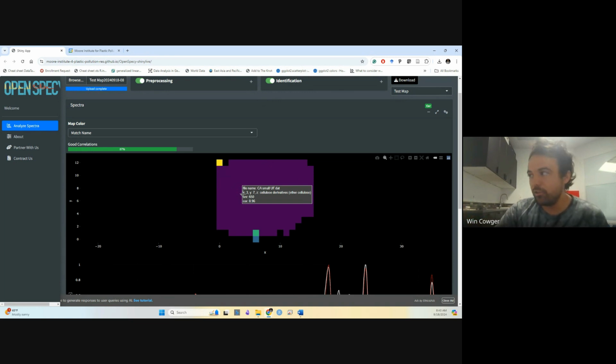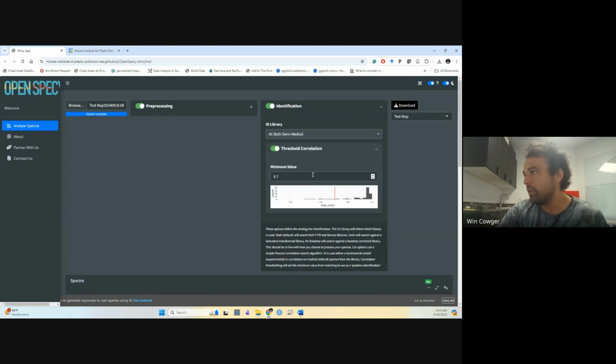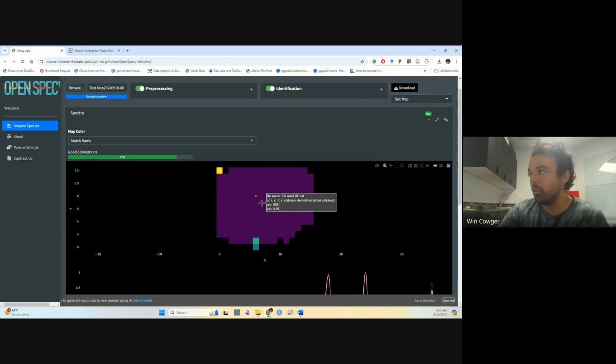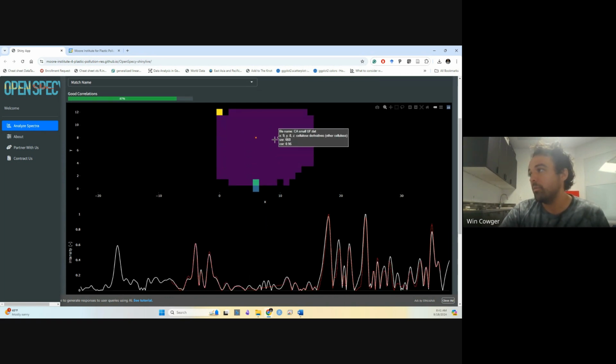And so you could have also just said, all right, let's use identification, let's identify what all the spectra are. And then we see this particle pop out of the background, this one cellulose acetate particle, cellulose derivative, and that's your identity. You're like, okay, great, I have one cellulose acetate particle. Awesome.